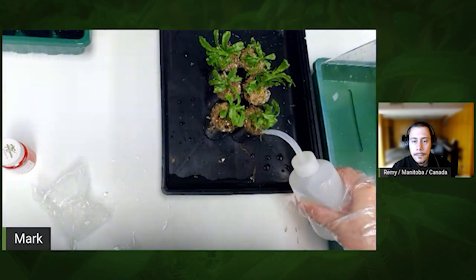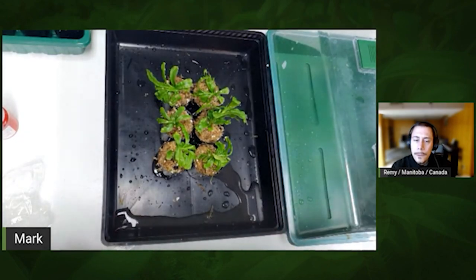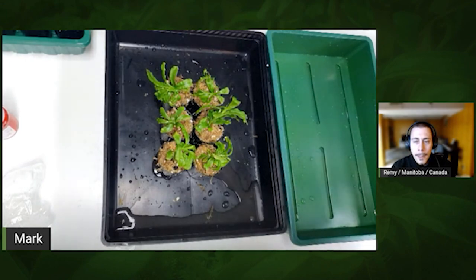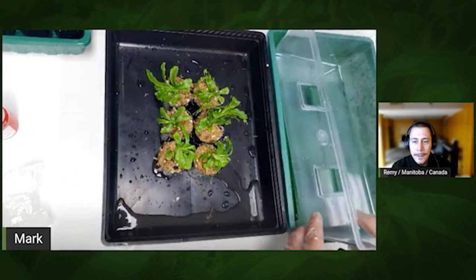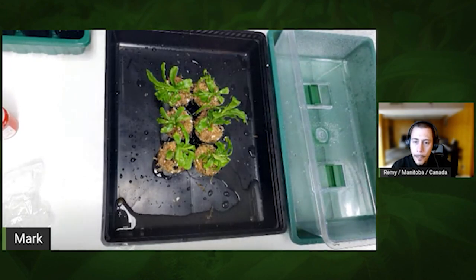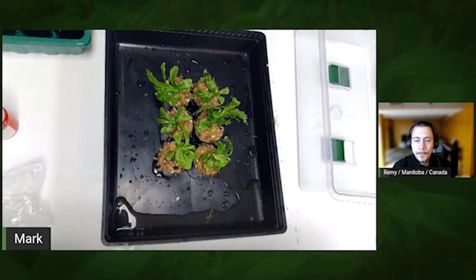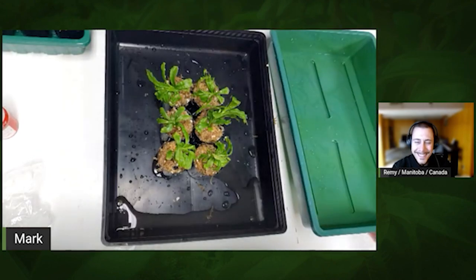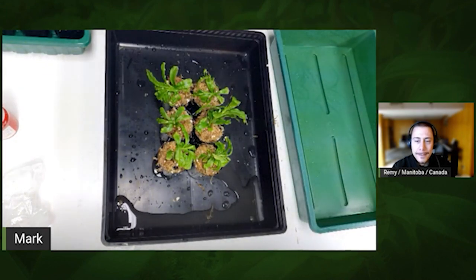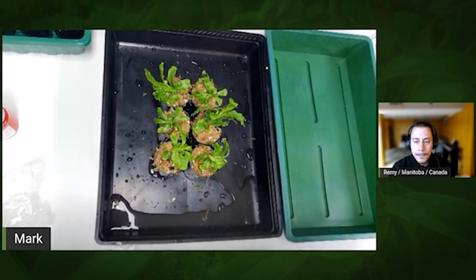I'll just add a little bit until I see water coming out from the drainage holes — that's enough. I can see the water leaking from down there already. I can't stress this enough — you have to sanitize everything. I never open the dome for six weeks. You don't need to go and check on them every time — you have to resist. They could get contaminated if you always open and check. Since everything is sterile, there's a very low chance any fungus or organisms will grow.